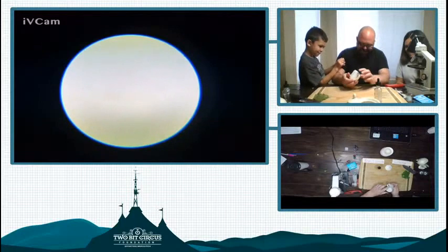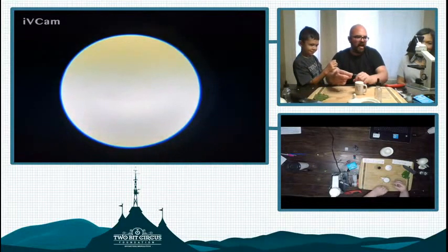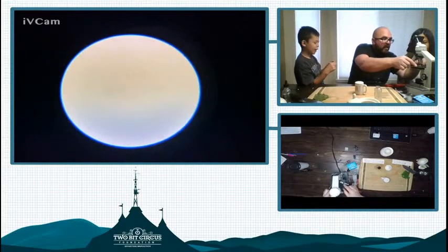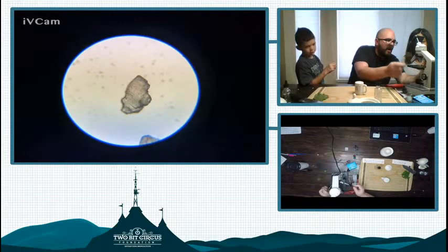Alright, we're going to see if you're alive in a minute. The one we're doing now, which is the last object we have on the table here, is the salt. So let's go ahead and put salt under the microscope. Robert's prediction was that salt is not alive.